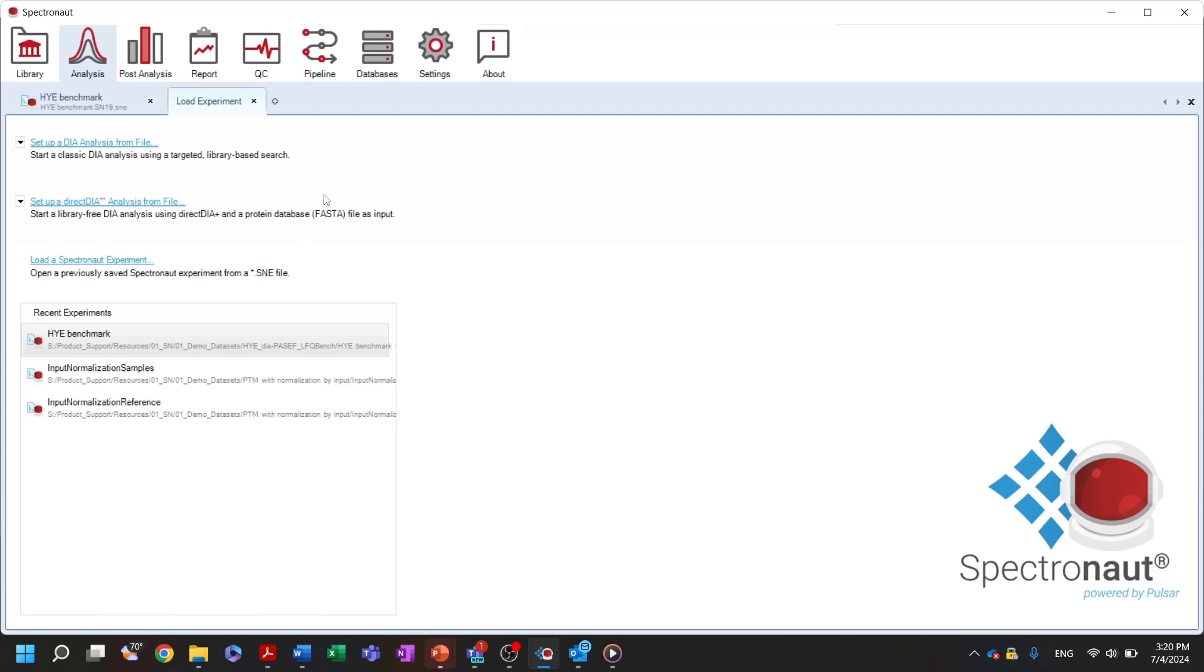Over here you can open previously processed projects saved as spectral node experimental files, in short, SNE files. Setting up DIA analysis in Spectronaut is straightforward. Let's do it together.